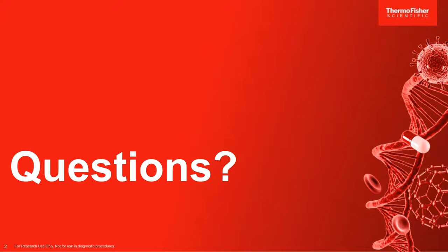Okay, great. Thank you. It looks like we have time for maybe one more question. I would like to know what next interesting experiments they are about to plan to test new limits of the CytPix, if you have any information on that. I think that is something that would be best handled by our collaborators at Thermo Fisher. Okay, great. Well, thank you.